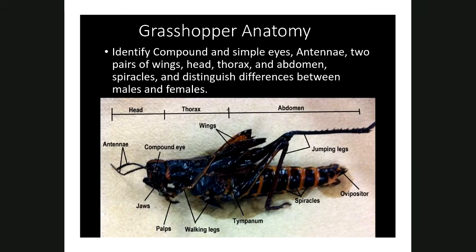Look at this abdomen here. It's highly segmented as well. All right. It turns out that this is an insect that is, I guess you could say, I mean, I hate to say some animals are more advanced than others, but I would rather say this animal is not as divergent. In other words, it doesn't have specific characteristics that it has evolved that are different from the ancestor.